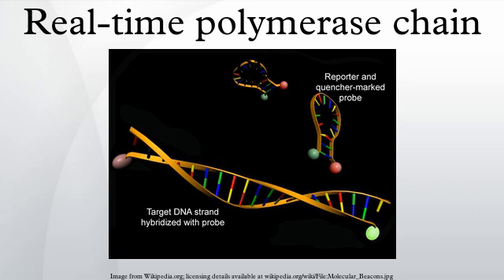For example, a DNA sample whose Cq precedes that of another sample by 3 cycles contains 2^3 equals 8 times more template. However, the efficiency of amplification is often variable among primers and templates. Therefore, the efficiency of a primer-template combination is assessed in a titration experiment with serial dilutions of DNA template to create a standard curve of the change in Cq with each dilution. The slope of the linear regression is then used to determine the efficiency of amplification, which is 100% if a dilution of 1:2 results in a Cq difference of 1.